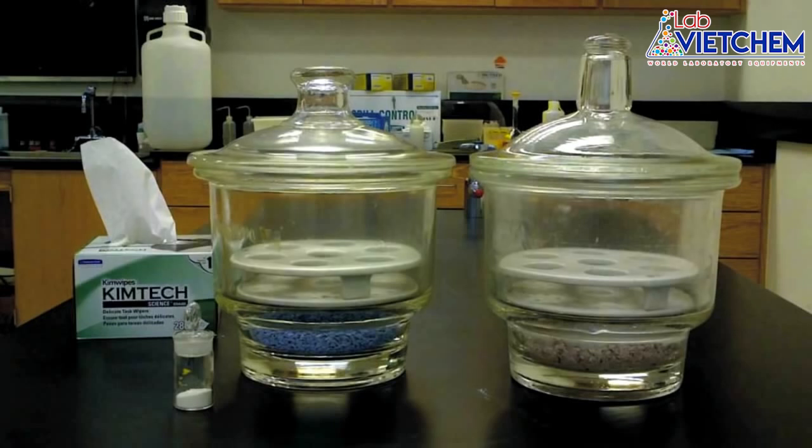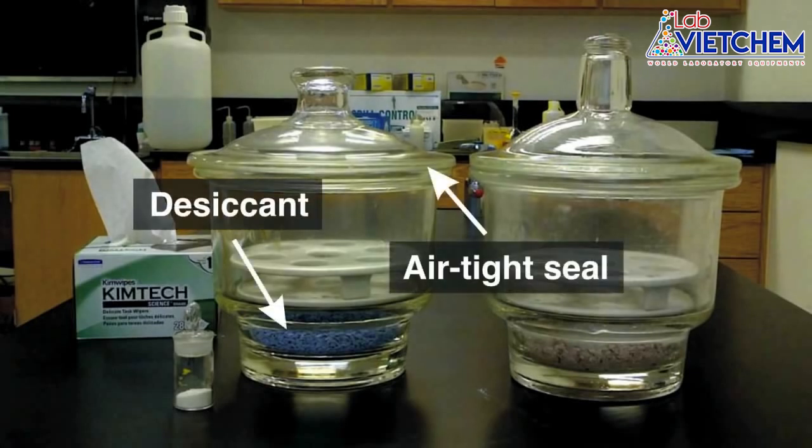This is important for some of the experiments you'll be doing, so pay attention. It has an airtight seal created using silicone grease, and a desiccant at the bottom to suck up any moisture.